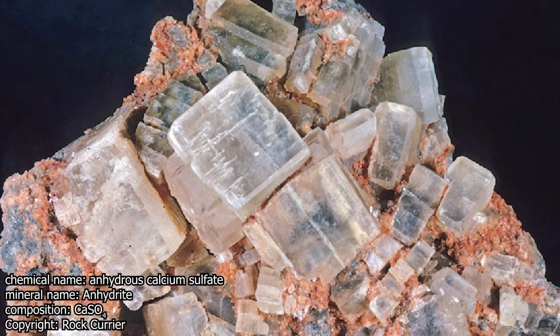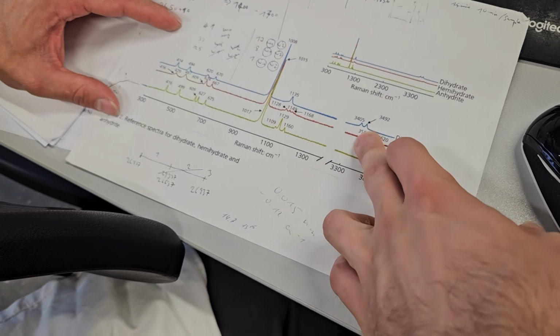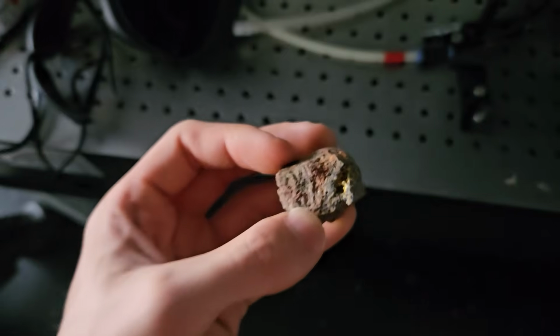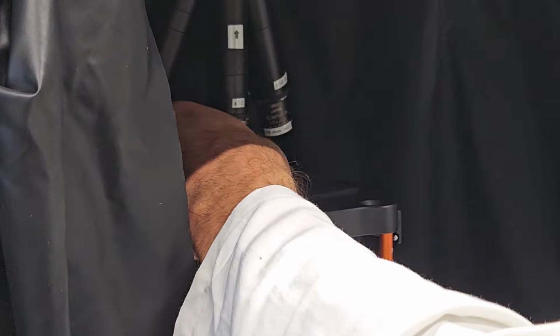However, it is not only chemists and geoscientists who can benefit from Raman spectroscopy. Biologists and medical professionals can also make effective use of this analytical method. In my opinion, it's a fantastic device that I will hopefully from now on feature quite regularly in my field trip videos. For example, when I come across an interesting looking mineral.